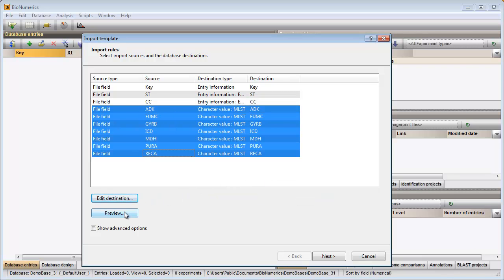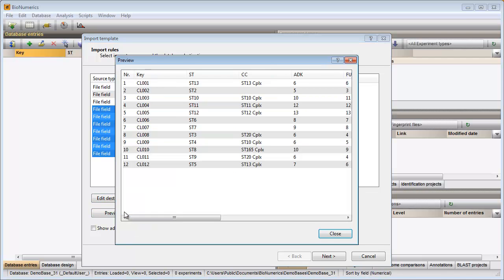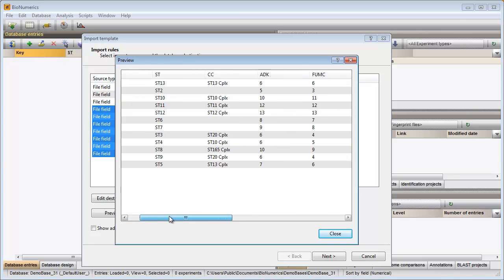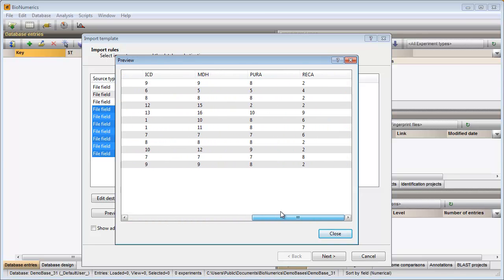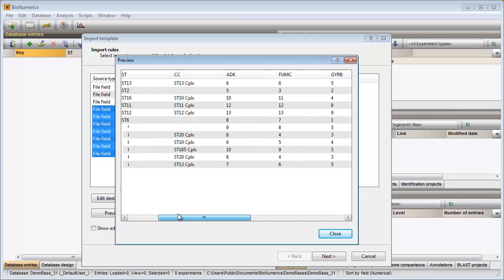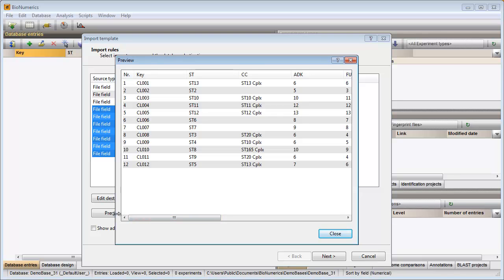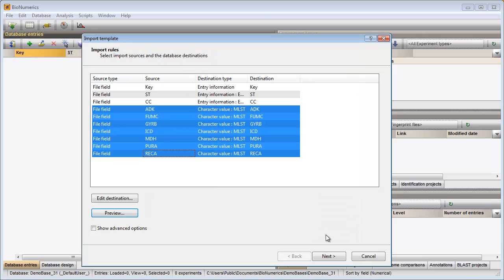By clicking the Preview button I can check whether the columns of my file have been assigned correctly. If so, I can close this window and click Next.